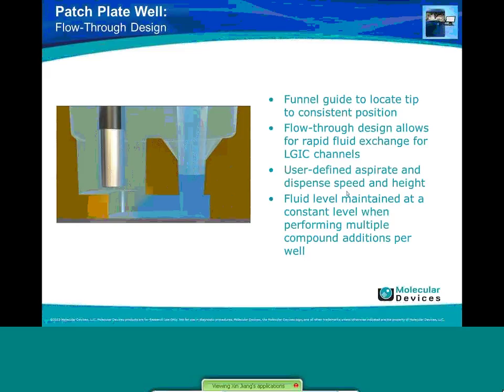And after each compound addition, the fluid level is maintained. The way this is done is that before the second compound addition, the volume of the previously added compound is removed before you add the second compound. So the fluid level is always maintained at a constant level, which makes it easier to perform multiple compound additions at the same recording site.